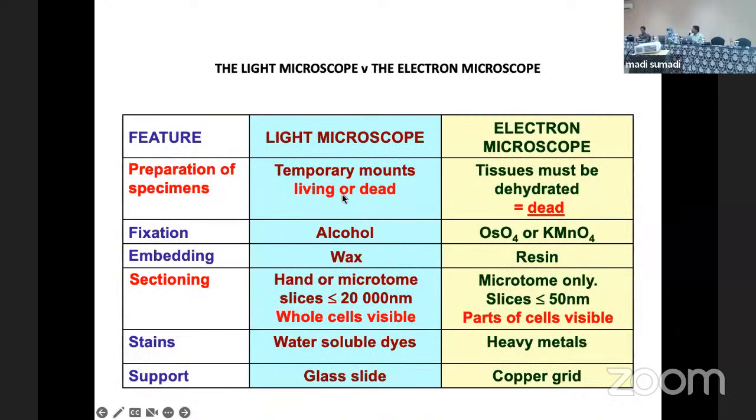With the light microscope, we can also put a cell culture under the microscope and you can do live cell imaging, which is very nice, where you can track things. But these things are labeled with some antibody or some dye, and you don't see the real structure. But with the electron microscope, unfortunately, we don't see live ones, we can only see the dead ones. So this could be one of the negative parts. You see the real structure, but this is not live, this is dead. So it means you're looking at dead things. Something could happen after death that we do not know, right? There could also be generation of artifacts.